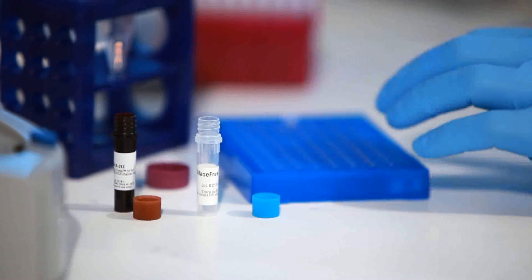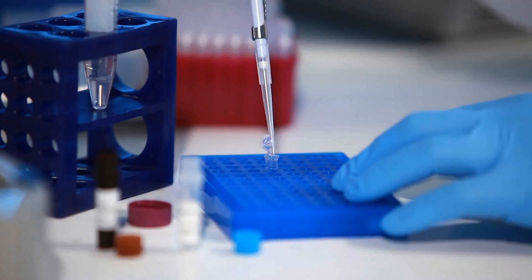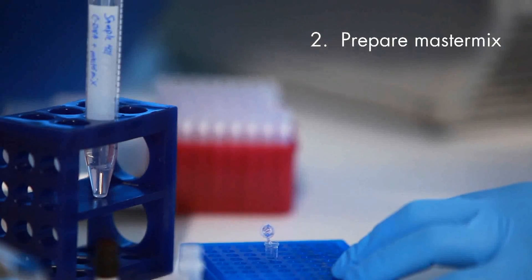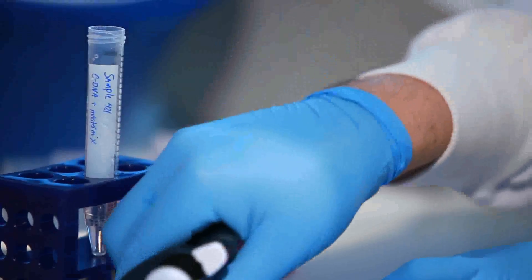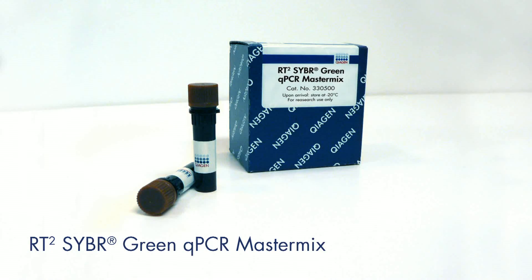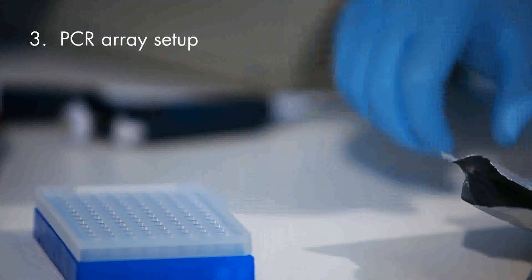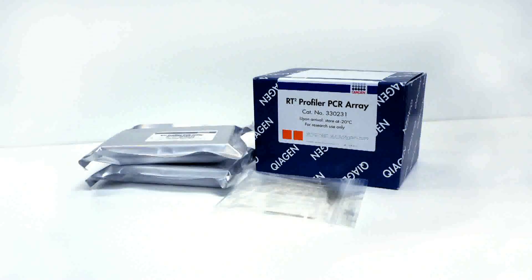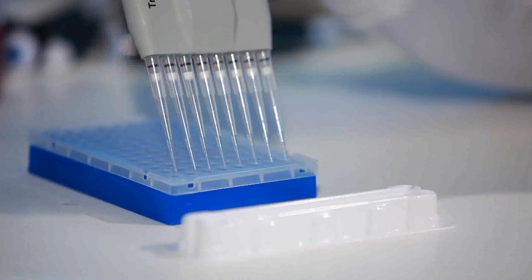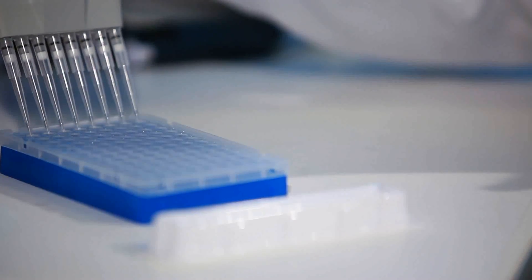We are now ready to load and run our RT² Profiler PCR Array plate. Combine the RT² qPCR master mix, diluted first strand cDNA synthesis reaction, and nuclease-free water. Remove the RT² Profiler PCR Array plate from its sealed foil bag, then add your sample to each well, preferably from a reservoir with an 8-channel pipettor.